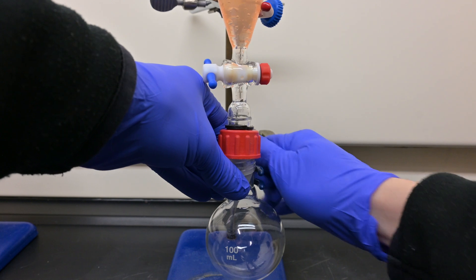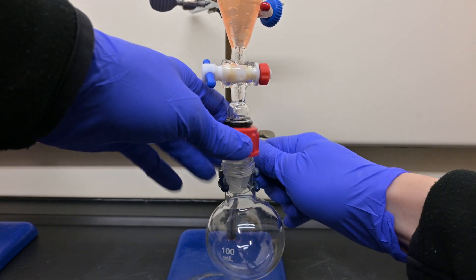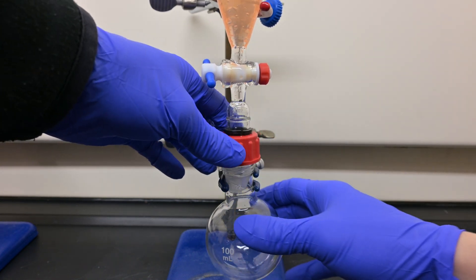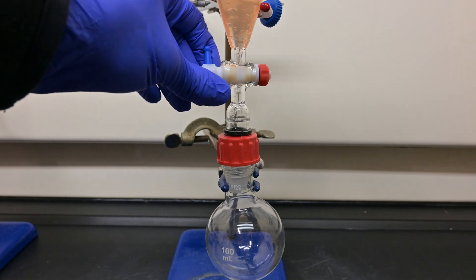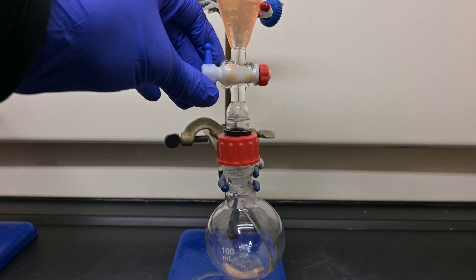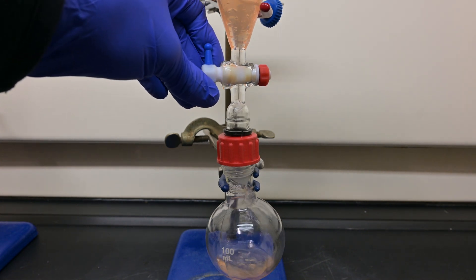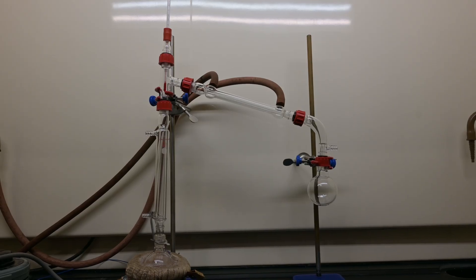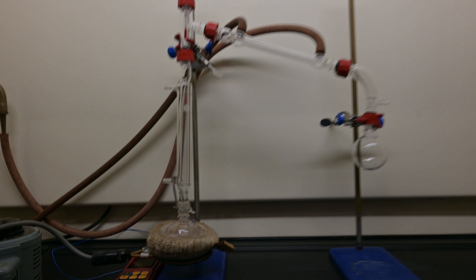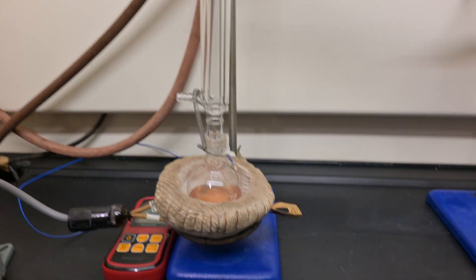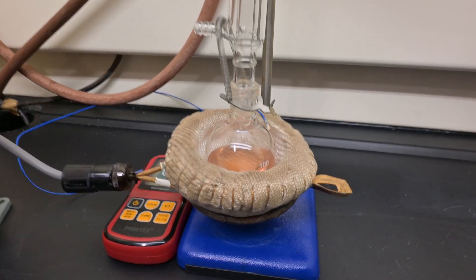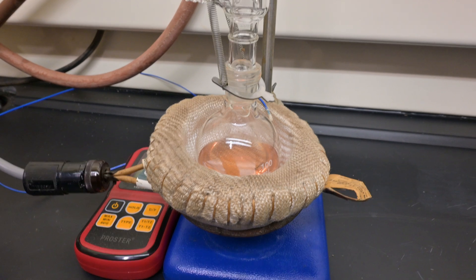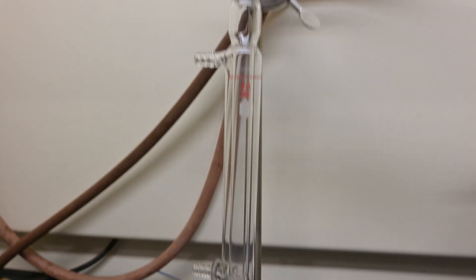Next, the crude is transferred to another flask, and another distillation setup is created. This time we will include a condenser between the distillation adapter and the crude flask. This will act as a fractional column allowing larger temperature control.